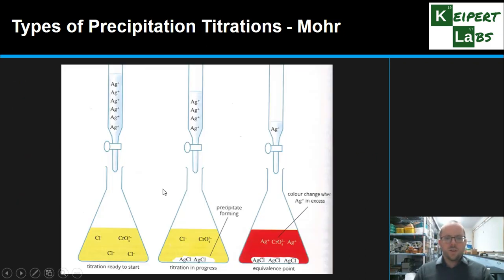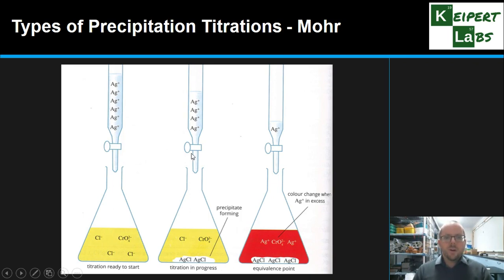You can see the three different stages of a titration. It's set up and ready to go — we've got chloride ions with the chromate in there as an indicator. As the titration is in progress and silver ions are draining out of the burette, we get formation of the precipitate, but we've still got excess chloride ions remaining. But as soon as we've reached that equivalence point, we have excess silver and we get a colour change, forming that reddish-brown silver chromate colour.